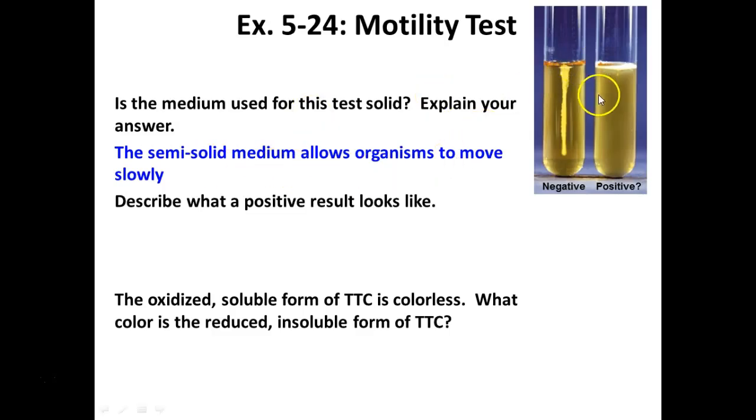If we didn't use that, especially with non-motiles, you can see that really well because you will see where they stayed, where you stabbed them in. But for positives, a lot of times they're going to diffuse a lot. You guys saw that you had a lot of diffusion, and you were able to see that cloudiness because of the TTC. Where if we didn't have that there, and you weren't a very observant student, you might not see that your tube is cloudy.